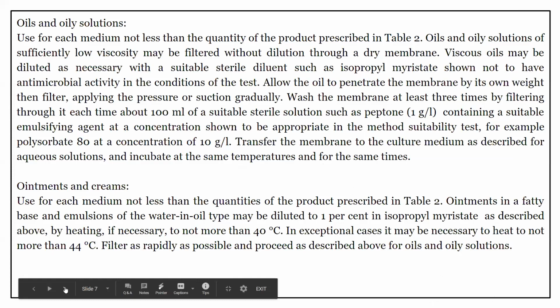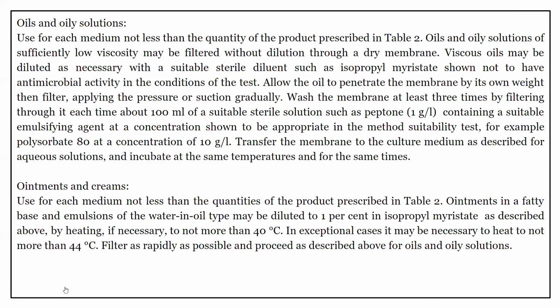Okay, so continuing with the membrane filtration, we are done with aqueous solutions. We are done with the solids which are soluble and will form a solution in a suitable solvent. Now next is oils and oily solutions. For this, use for each medium not less than the quantity of the product prescribed in table 2. Oils and oily solutions of sufficiently low viscosity may be filtered without dilution through a dry membrane specifically. Viscous oils may be diluted as necessary with suitable sterile diluents such as isopropyl myristate, shown not to have antimicrobial activity in the conditions of the test.